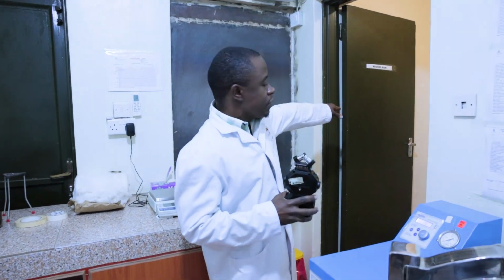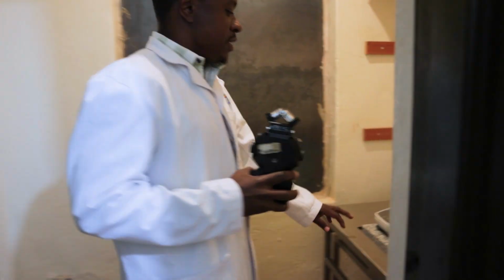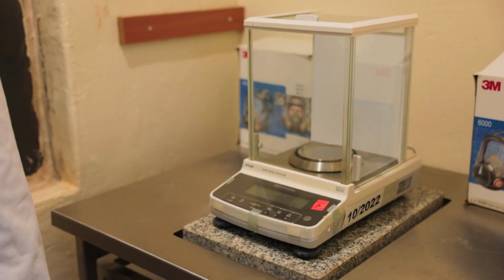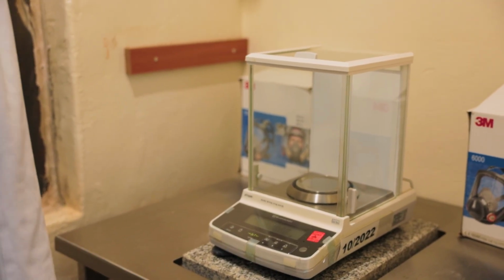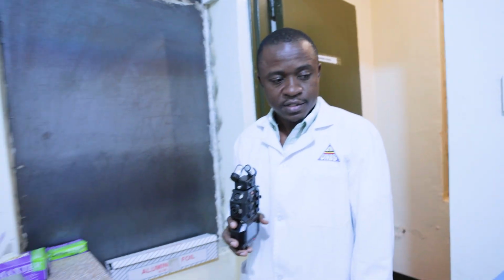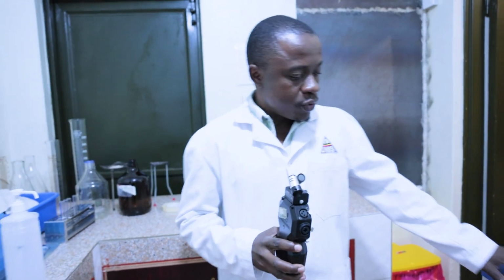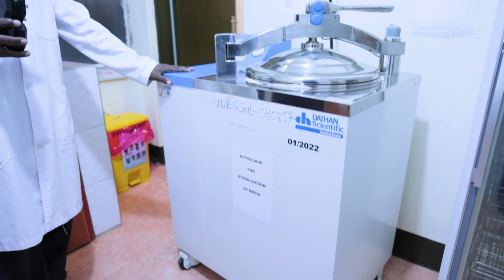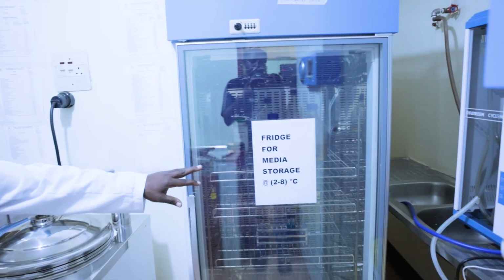So the process starts from our weighing room. Maybe you can come and have a look. This is where we do the weighing for everything that we use, especially what we call culture media. Culture media is, in simple terms, food for microorganisms. After weighing, we have the autoclave where we do sterilization. We sterilize from here, and then this is our fridge for the storage of the media which has been prepared.